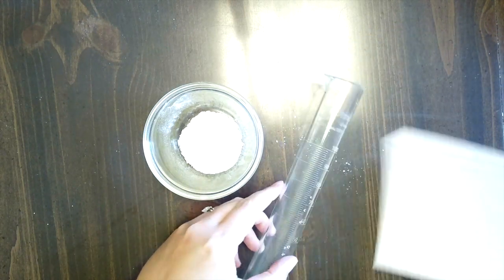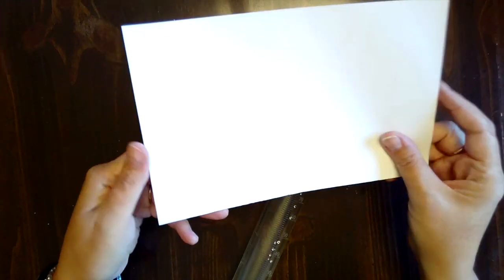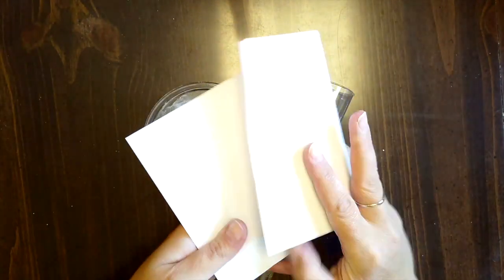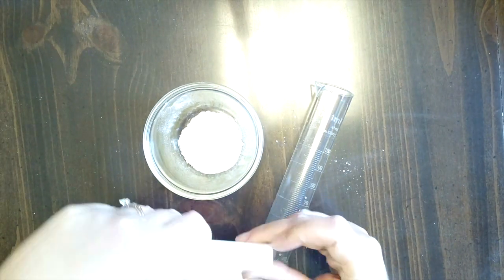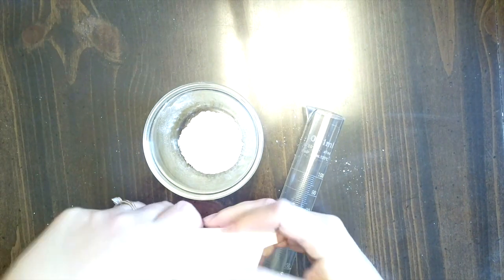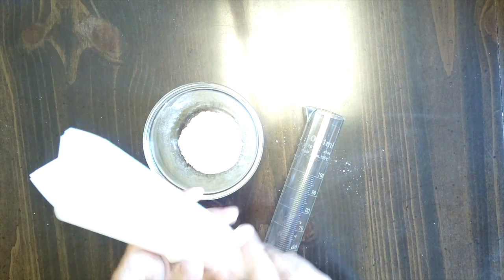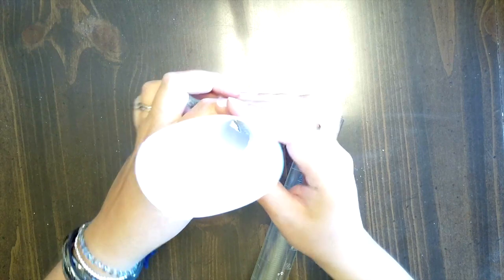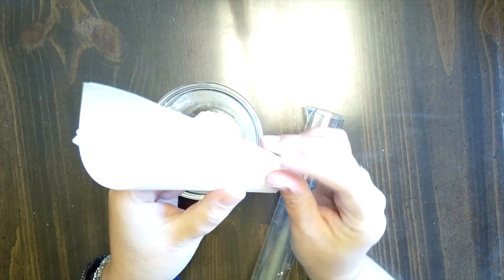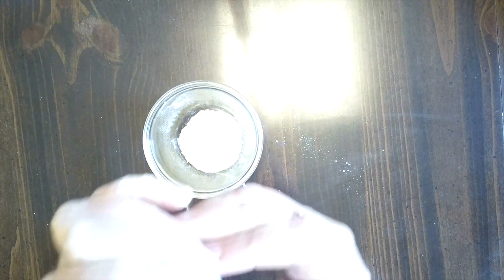So how am I going to get this in here? The easiest way to do that is to make yourself a little funnel out of just a piece of paper. I folded this one in half just to make it smaller. And all you have to do is kind of roll and make yourself just a quick little funnel. Almost like a cone shape. So see that? I'm going to use that to put my chalk into my graduated cylinder, like so. So there it is. And I'm going to go ahead and put it in. You can't see this part.